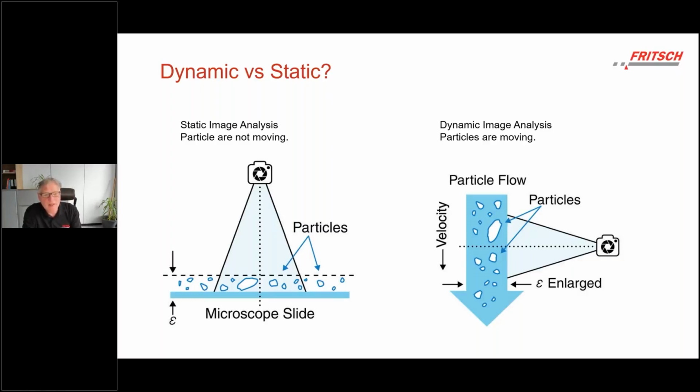And of course, as you can imagine, preparation here is again a challenge, because imagine you have a powder and you put it on a glass surface, and you want to prevent particles from sticking together, and you want to have a rather homogeneous distribution or density across the whole area. So this is for sure possible, but it's not that straightforward.